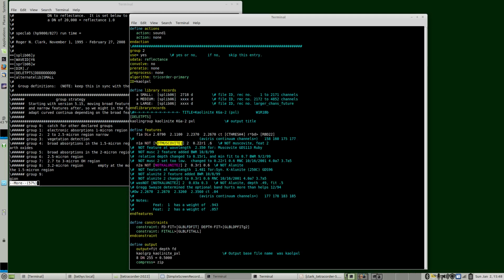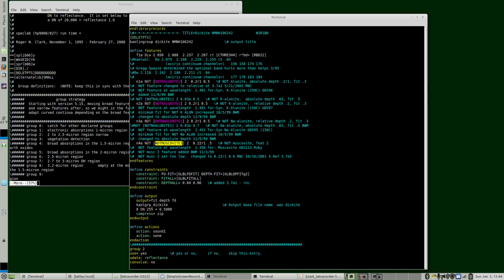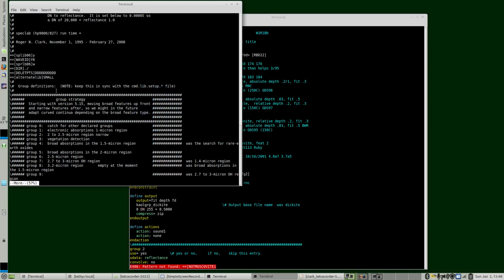This is... got to find where. This should be the definition. So it's not in here. It must be... oh, it's in the knots.